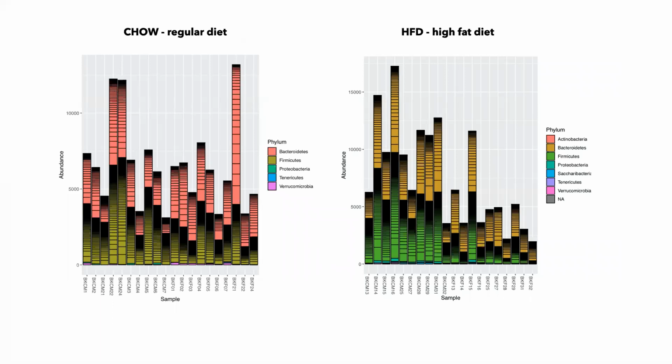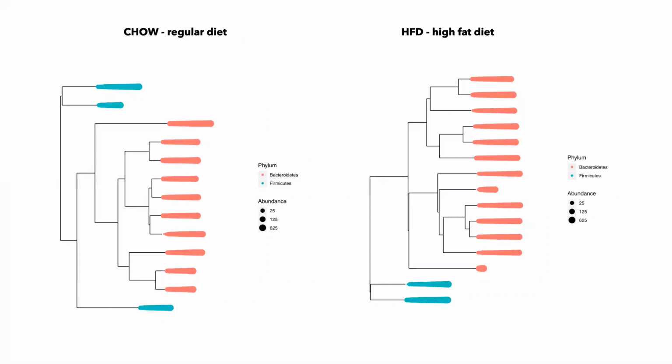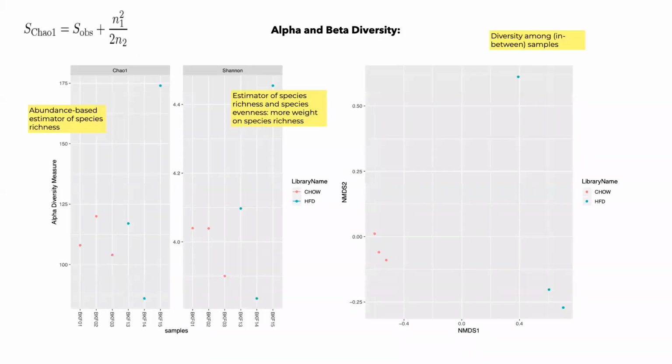And to do that, this PhyloSeq downstream analysis first of all looks at distances, phylogenetic distances, using ape, which is just a way to construct a phylogenetic tree, and converts that into a statistical measurement that explains to us how this represents the data from the standpoint of alpha and beta diversity. So alpha diversity and beta diversity.